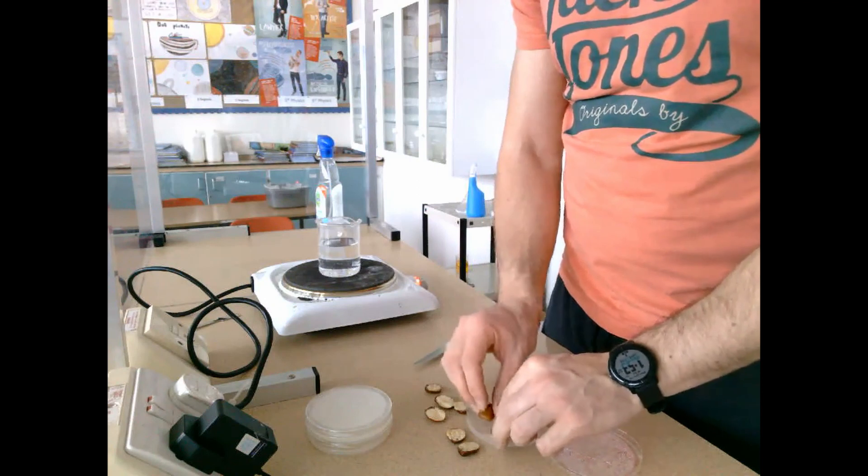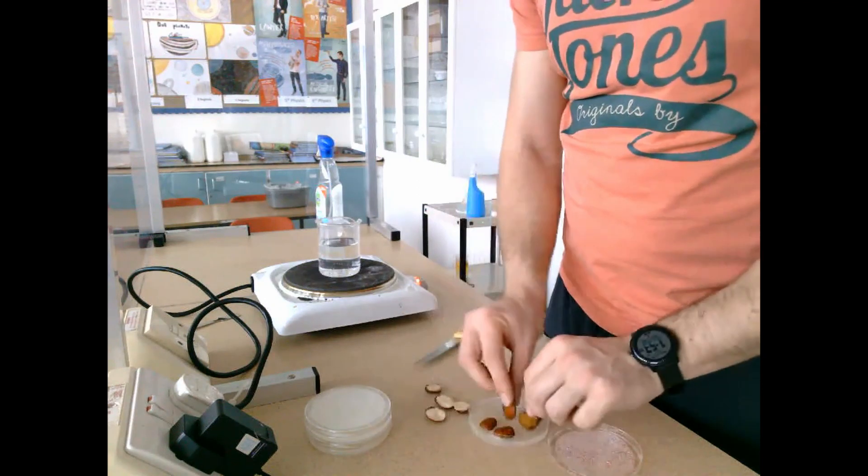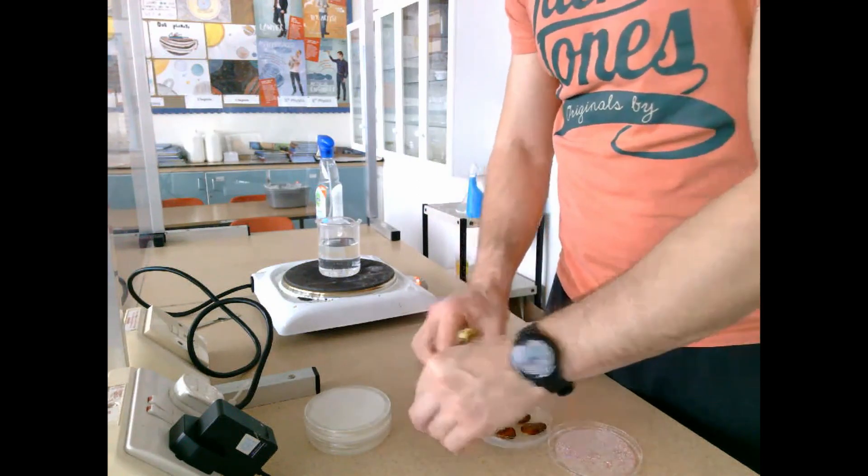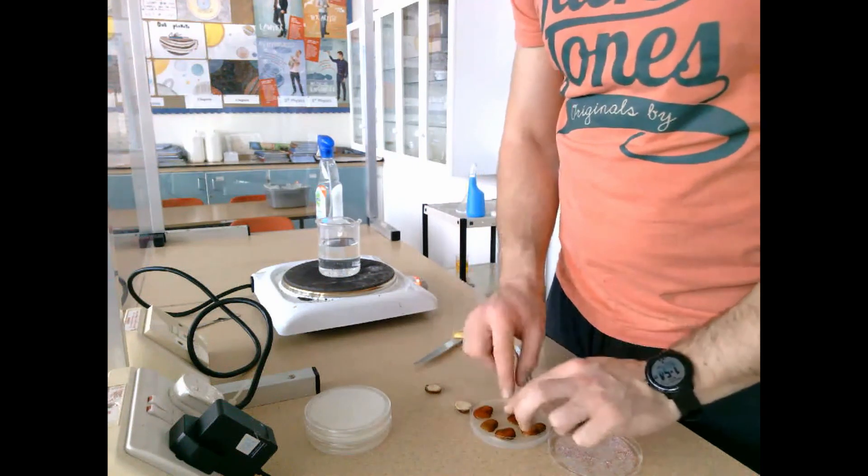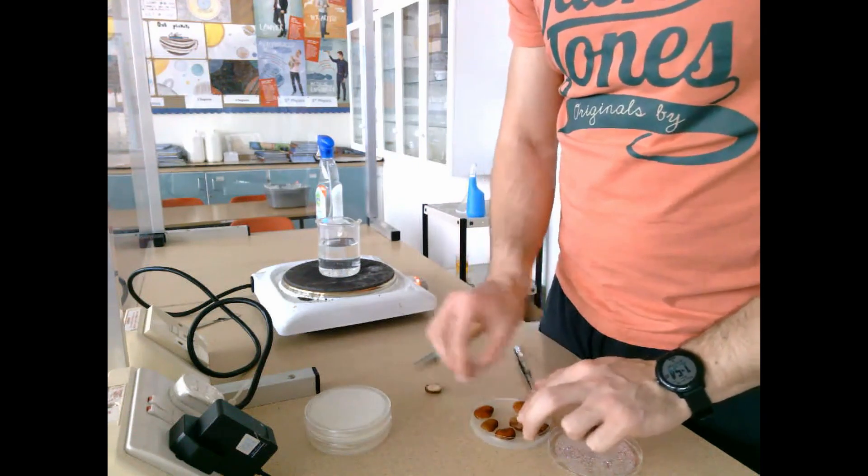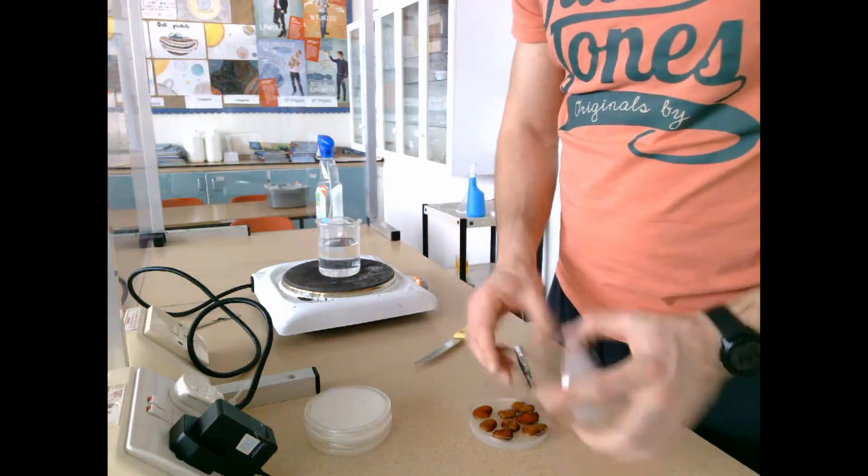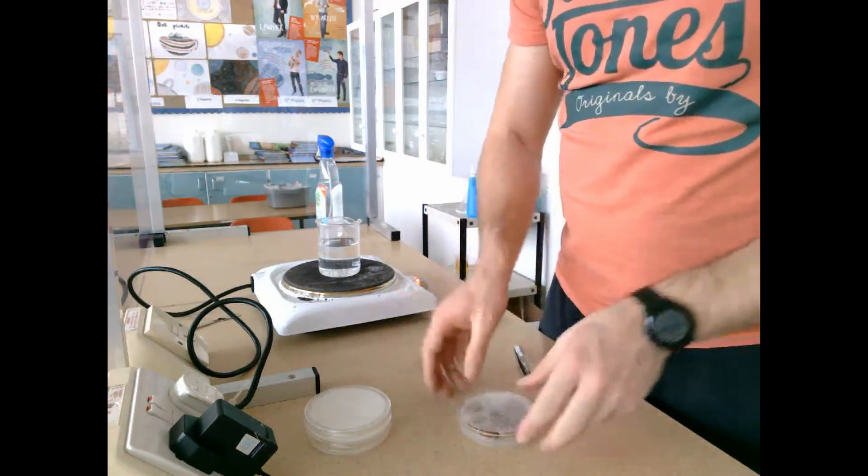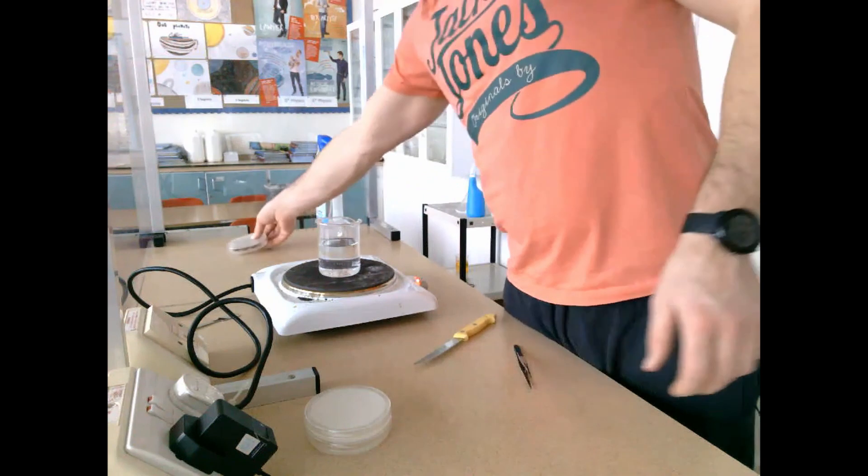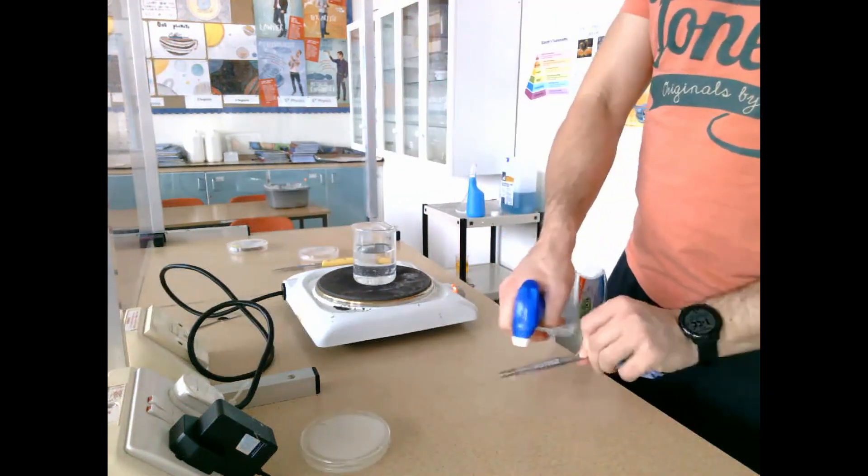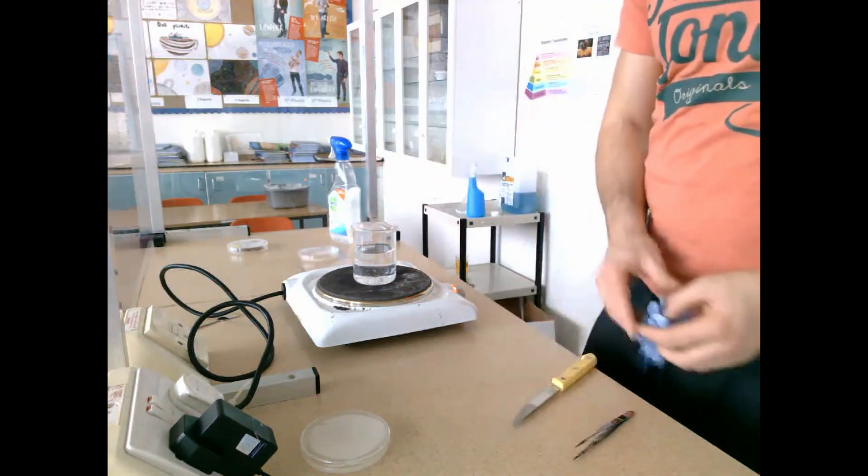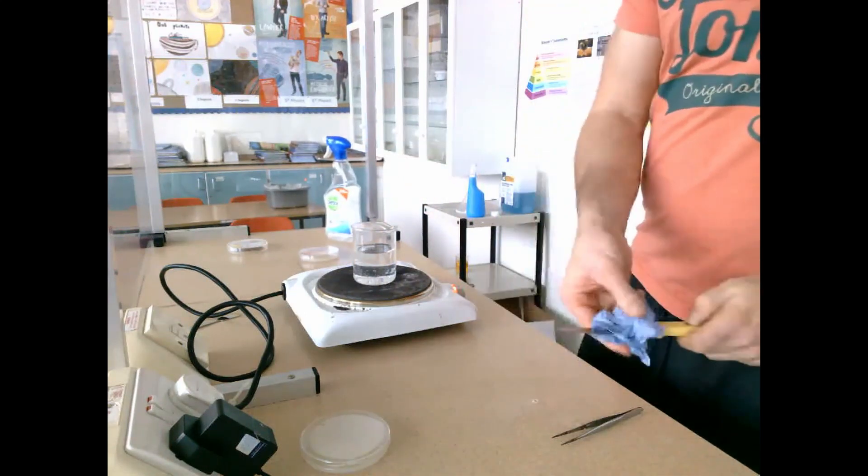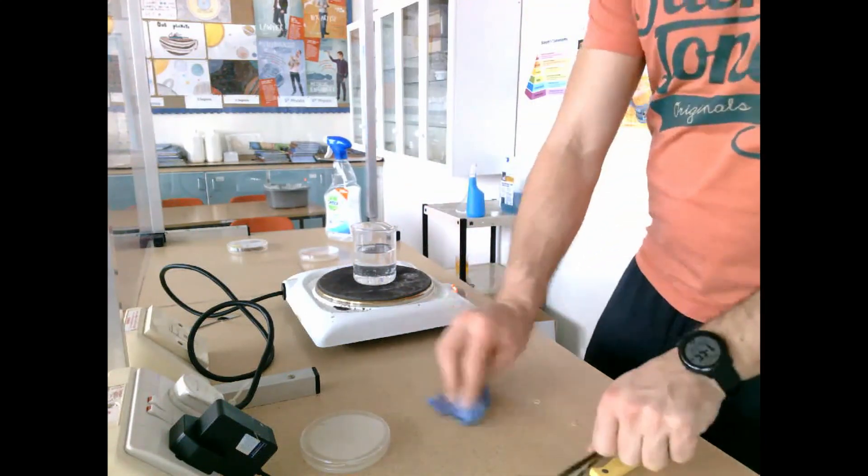Once all four seeds are done, I get my starch agar plate, take off the lid, and place the seeds face-down on the agar. This exposes the digestive enzymes of the seed to the nutrient they're going to work on—in this case, starch agar. Once all eight halves are on the agar, I close it over and place it aside to prepare for the second part.